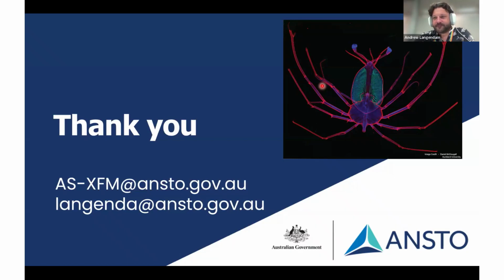Do we have more questions from audience or in the chat? Let me see. Here we have a question. Any advice on how to prepare samples comprising thin section of rocks for XFM? How well polished do they have to be? And does coating affect the quality of the maps?